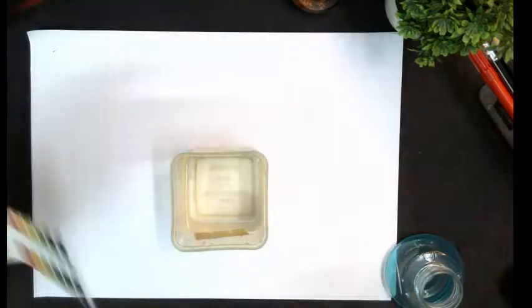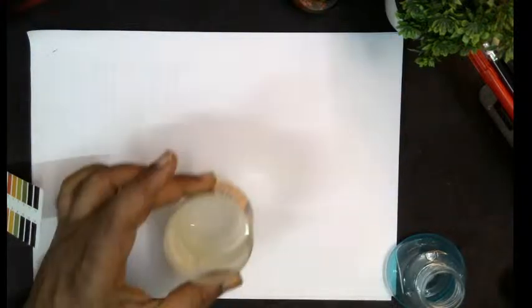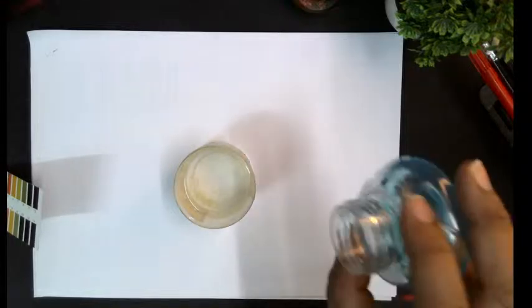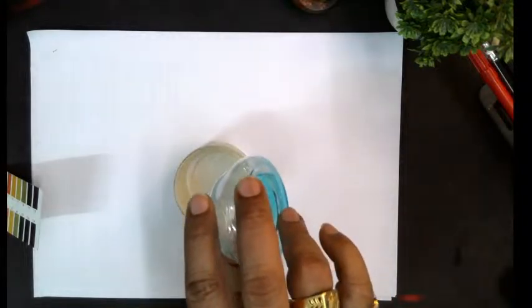Now let me take another beaker of water and let me add some detergent. This is a liquid detergent.